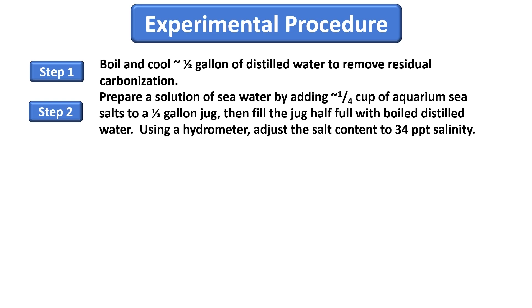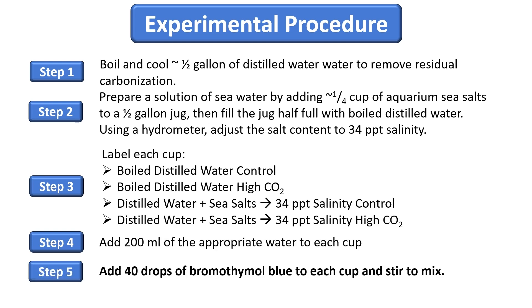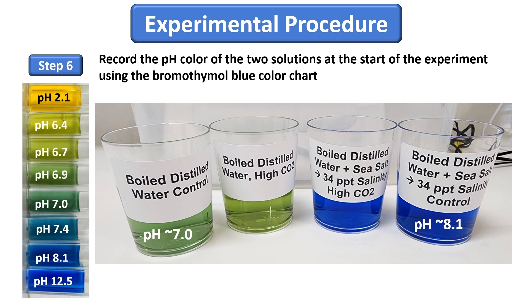The sea salt and hydrometer can be found online or at pet stores. Label four clear plastic or glass cups as shown, then add 200 milliliters of boiled distilled water or simulated seawater to each cup per its label. Add 40 drops of bromothymol blue to each cup and stir. Record the pH of the solutions in each cup using the bromothymol blue color chart as a guide. Degassed distilled water has a neutral pH of 7, and our simulated seawater has a pH of about 8.1, which is typical of the world's oceans.